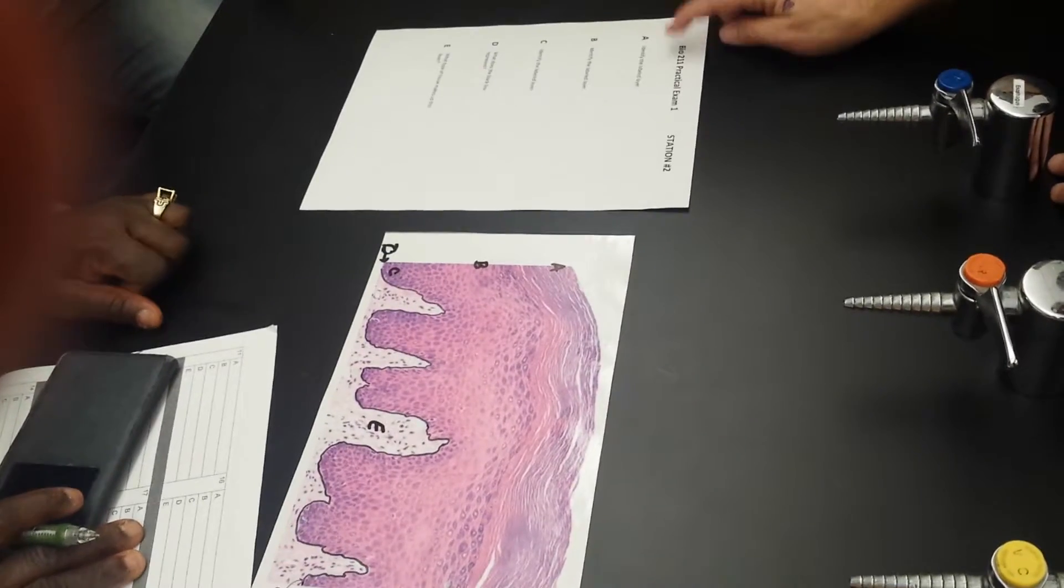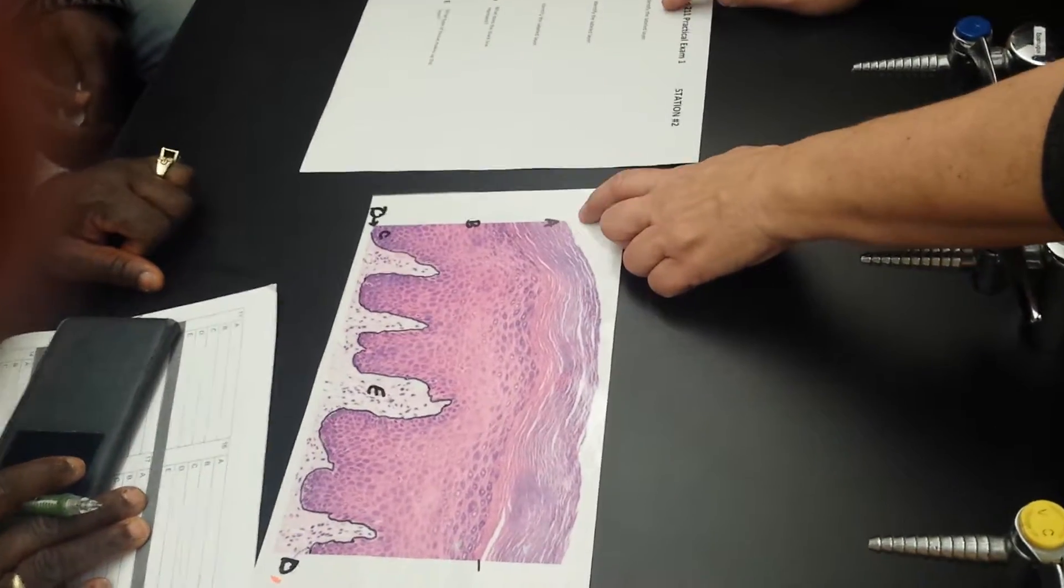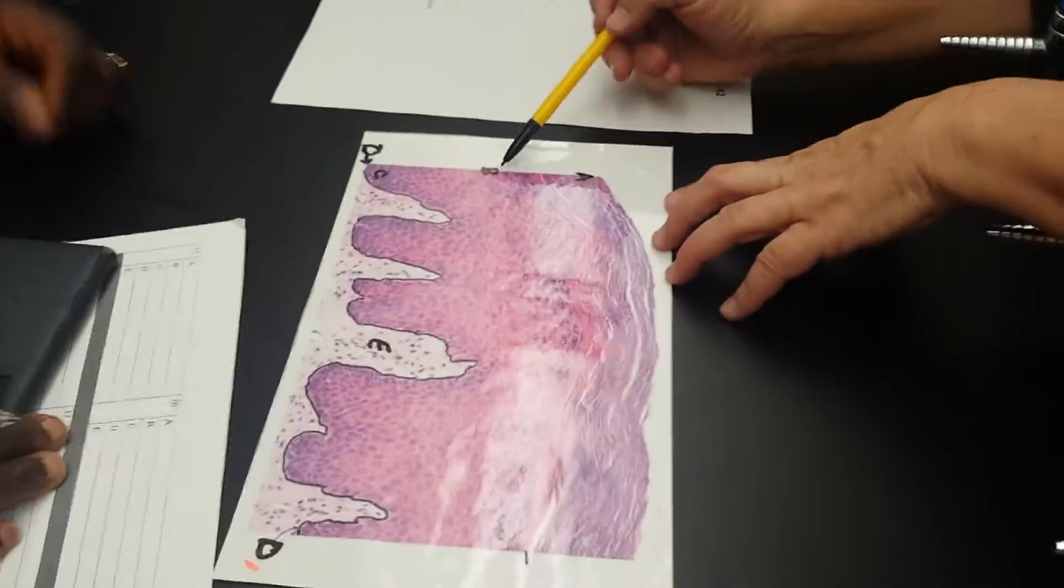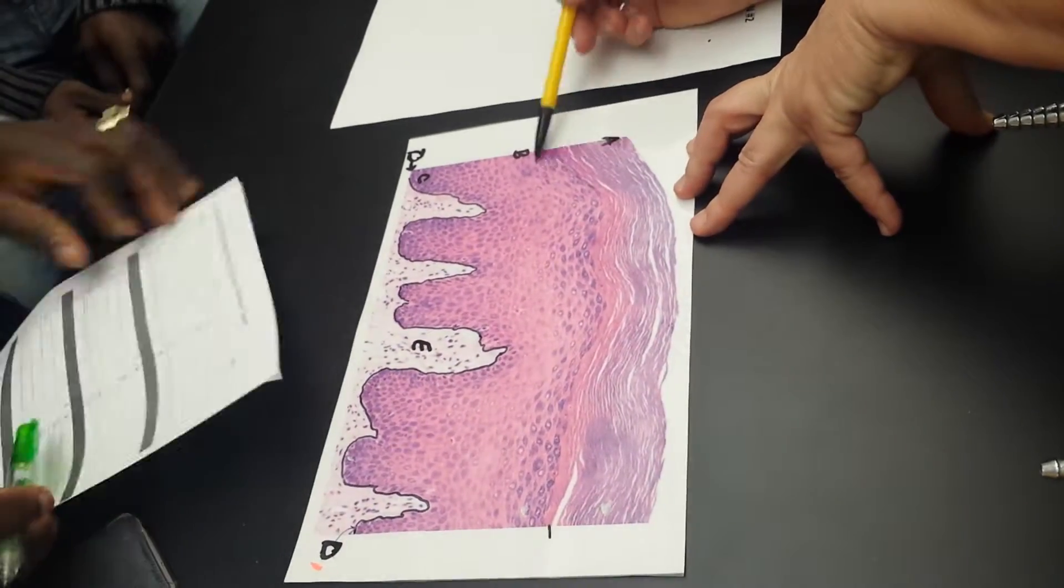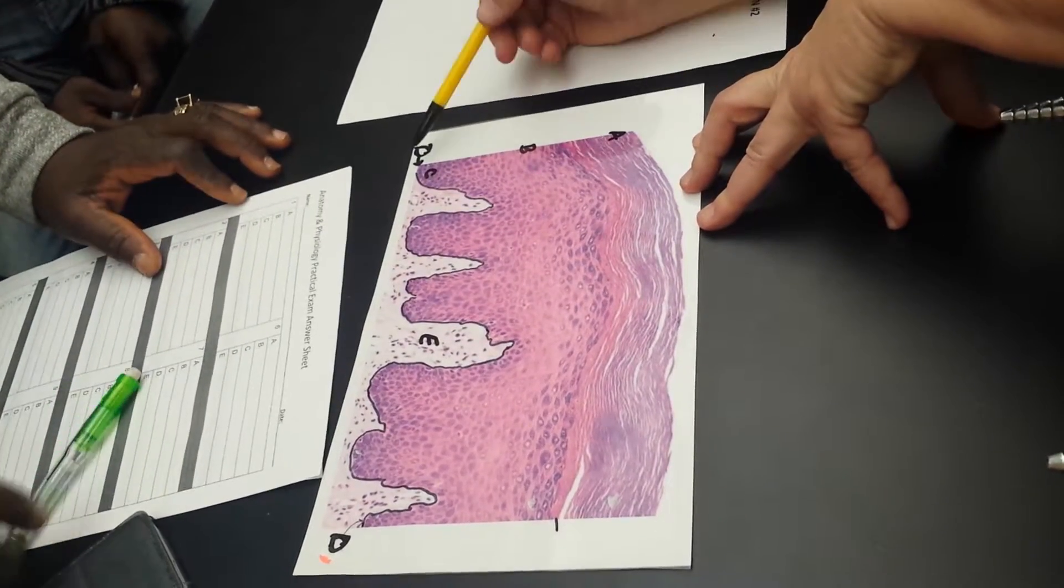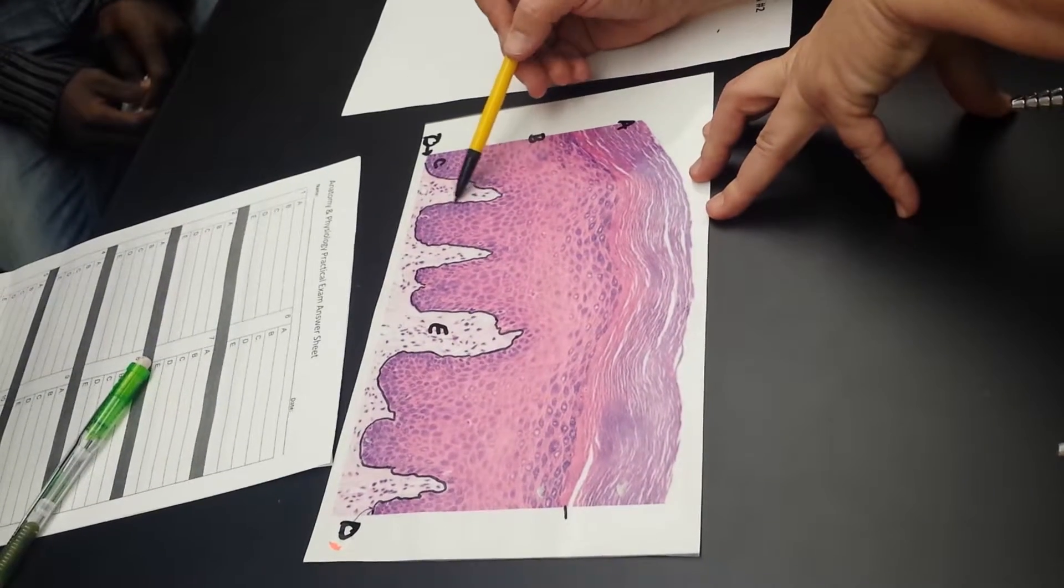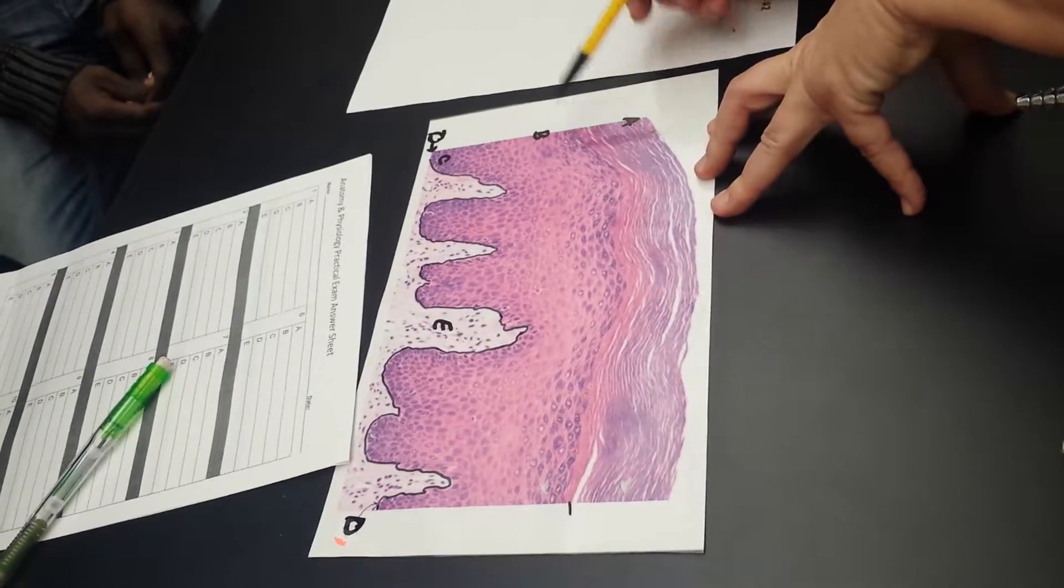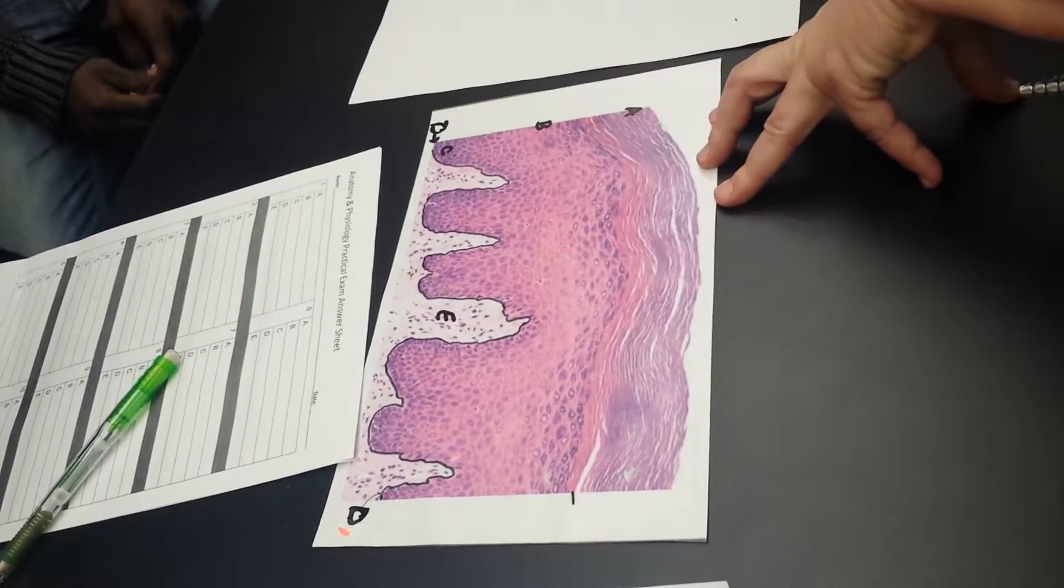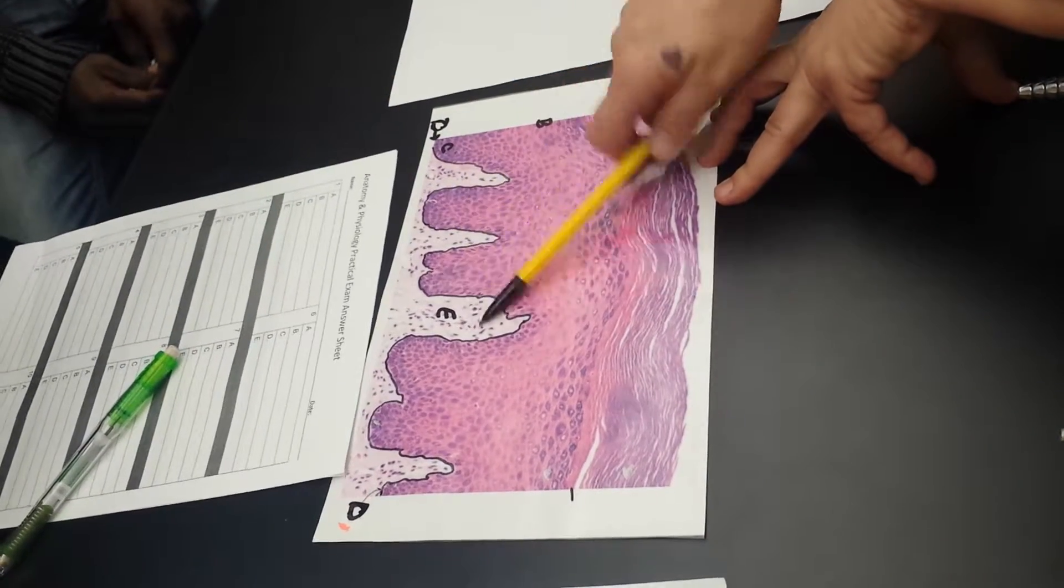Stratum corneum. It says identify the labeled layer. So this is stratum corneum, this B is, so this would be stratum granulosum, this would be spinosum, this is basal, this is the basement membrane, this is probably the lucidum right here because it's staining differently, and this is the papillary layer. And the tissue type, because you've got to read the tissue type, is areolar connective tissue.